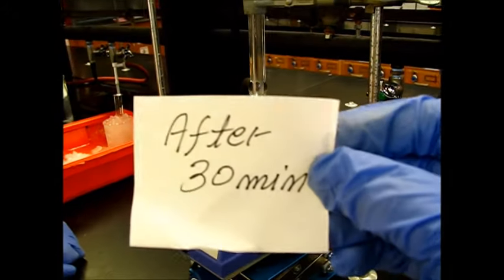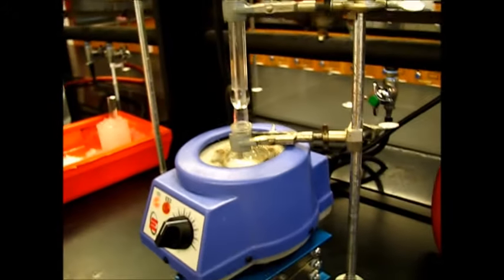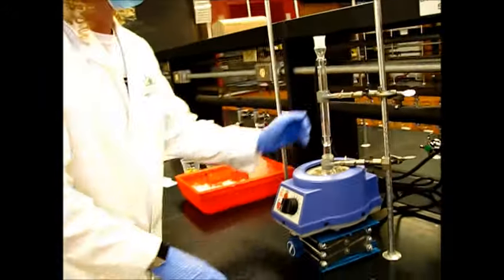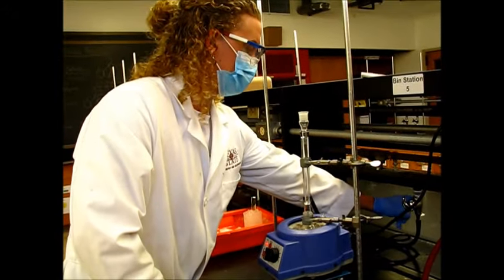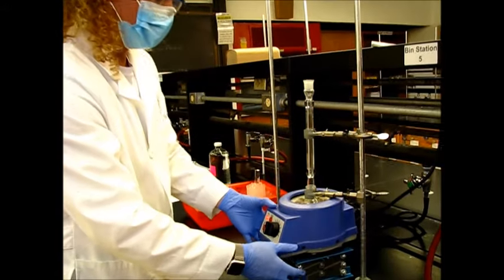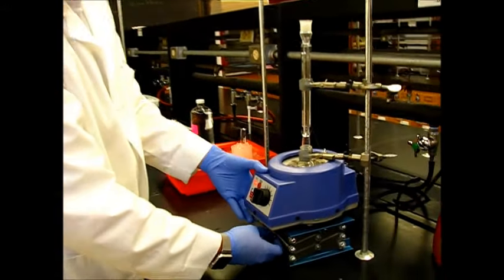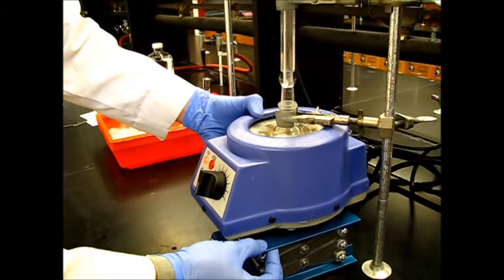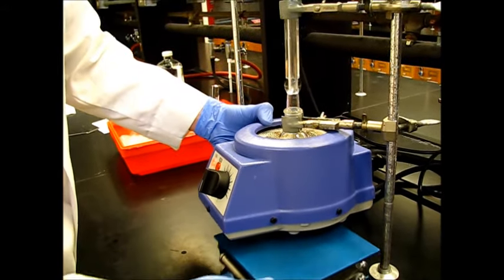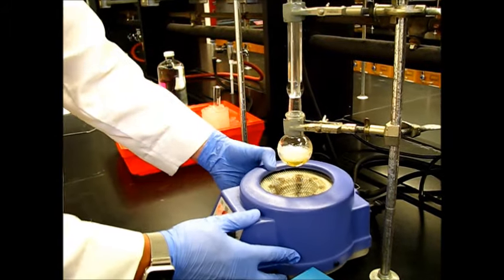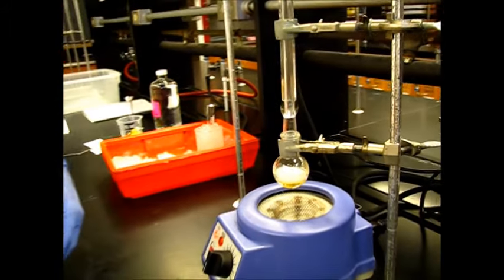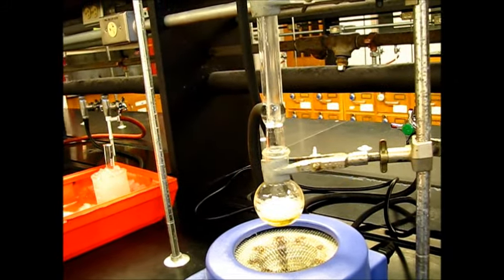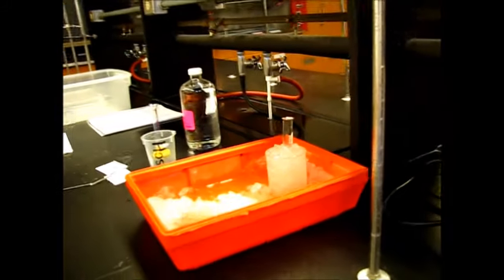So here we have completed 30 minute refluxing. So now what we're going to do is turn off the heat and turn off the water. We want to let this cool down to room temperature. So what we're going to do is just remove the heating mantle from right underneath it. And then just let this sit here until it cools down to room temperature where we're able to touch it. Once it's cool enough, we'll put it into the ice bath so it can really cool down.